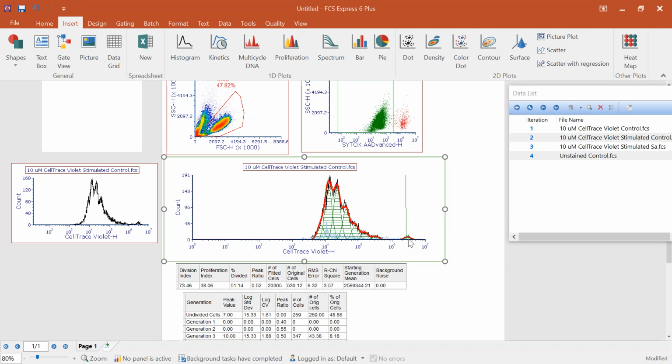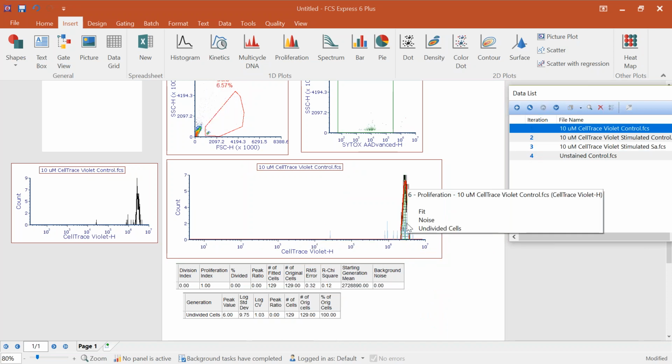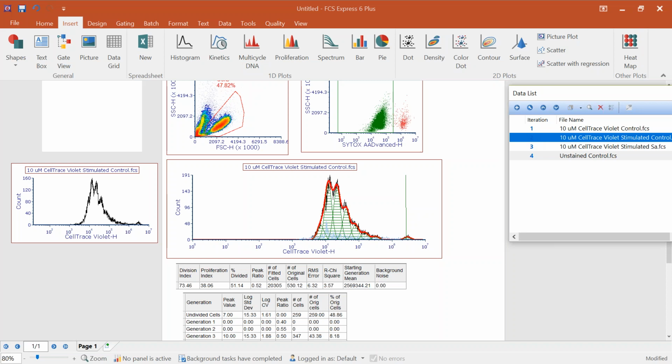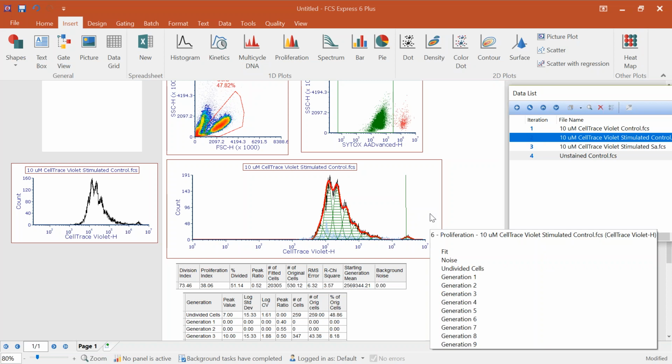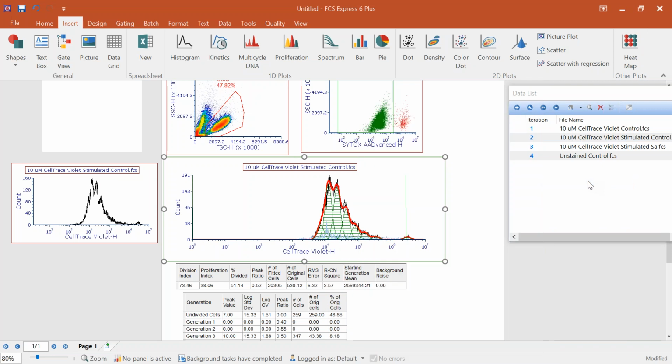And we can see this is somewhat offset to the left with this data file. When we come over to this one, it might be doing a little bit better job. And of course, it's blended in here with that one. But again, we're going to show you some better ways to set this up. And also, if we show the background, where the model is saying that this data should end, you don't see much. It's actually buried over here at 0.